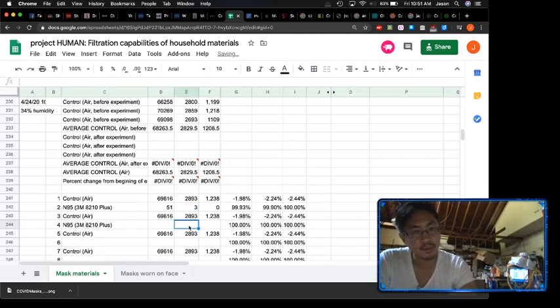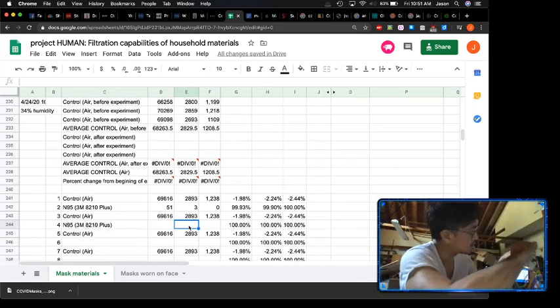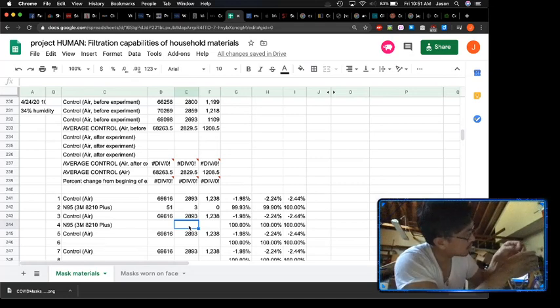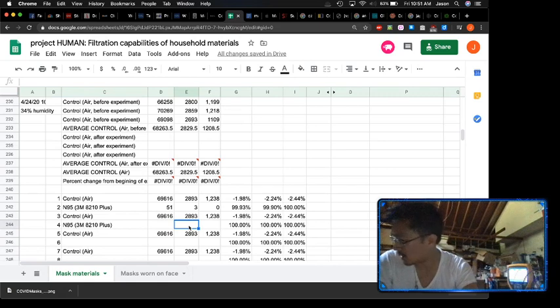99% efficient. So what I'm gonna start doing is control runs in the middle of each run, because these particulates keep changing. As you can see, I don't know if you guys can see the actual screen. Probably not. But we're heading into the high 60,000 particulates again.